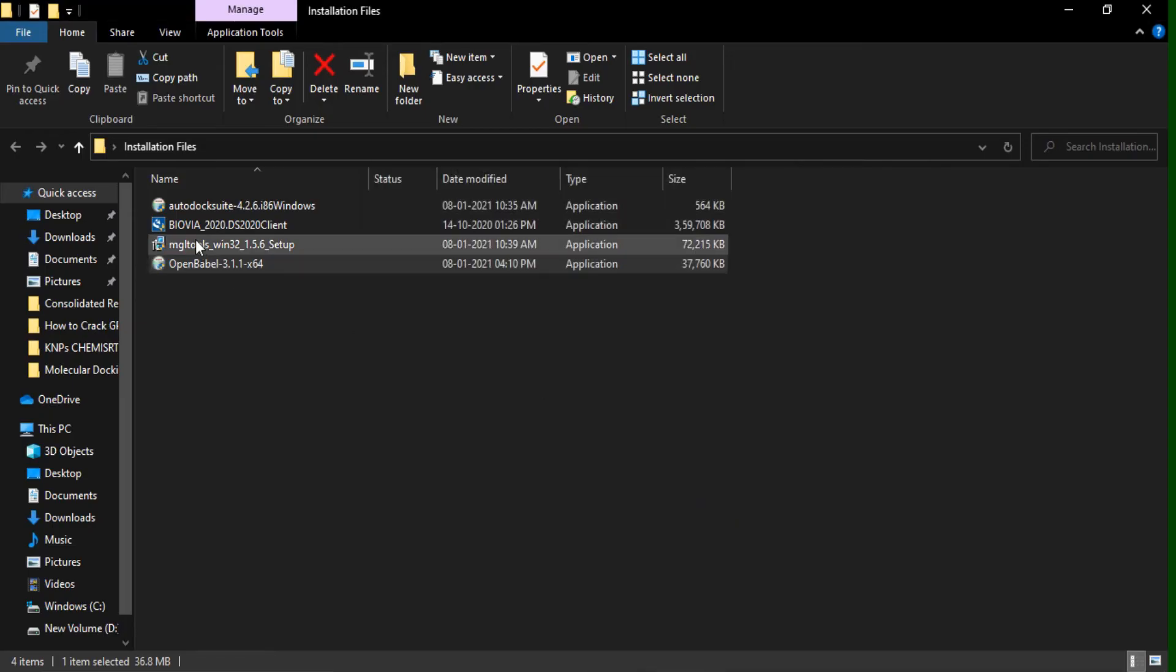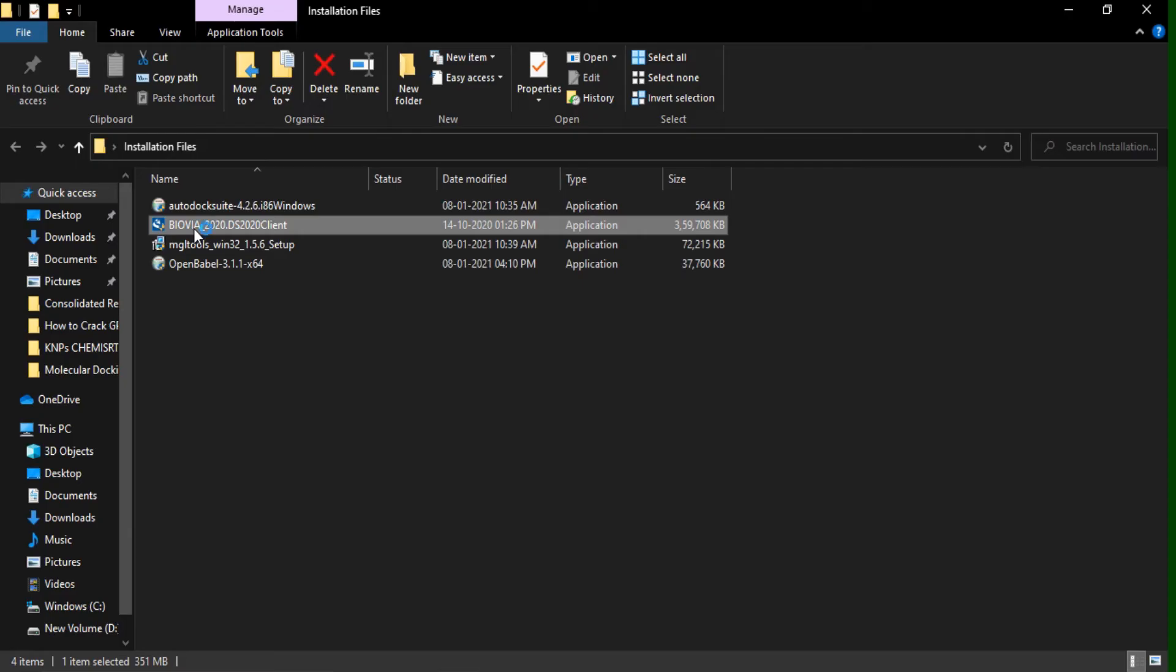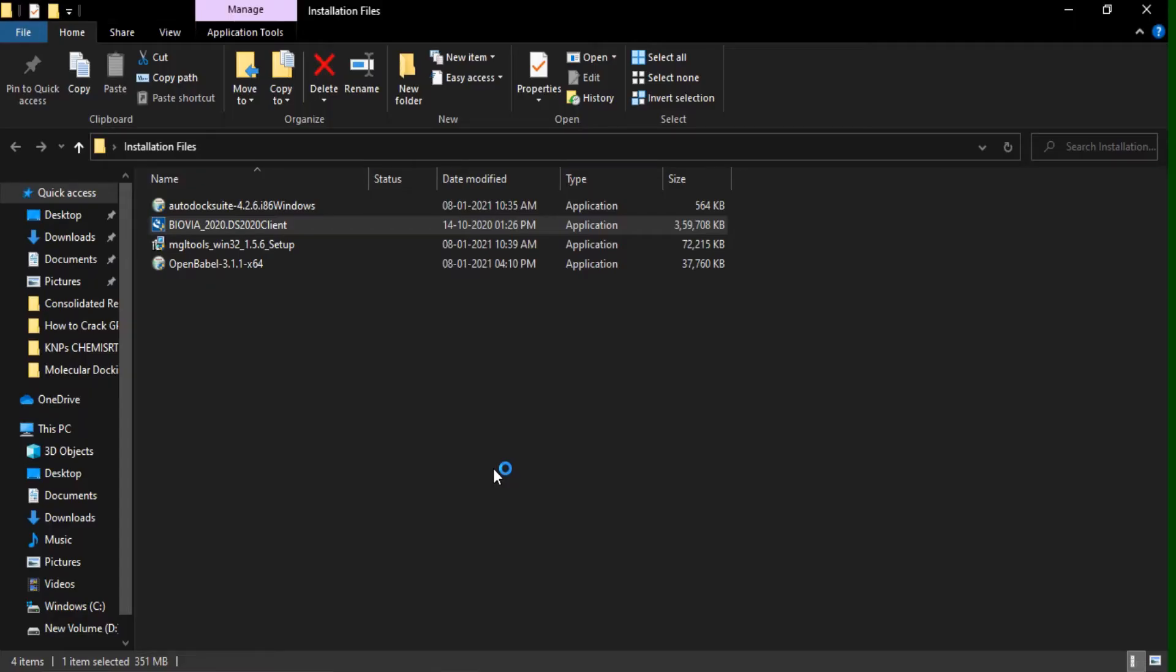And at last, our Discovery Studio. This will take a pretty long time for getting installed.